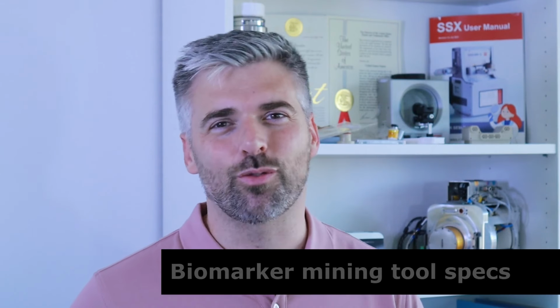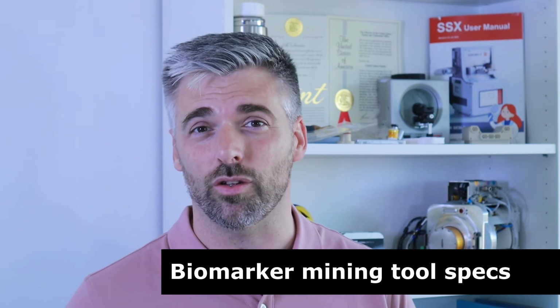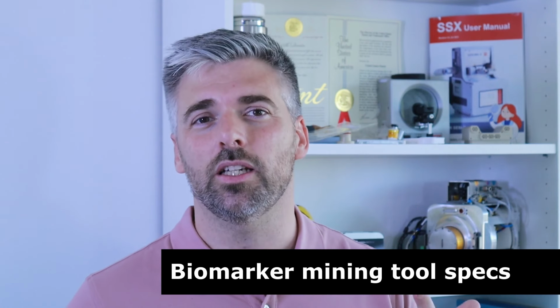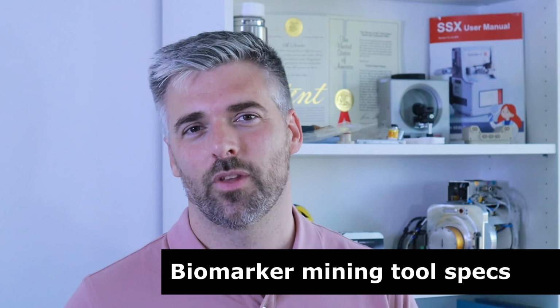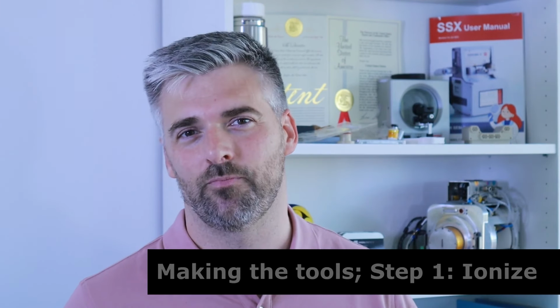To recap, the tools to enable breath biomarker mining must produce high-quality data for large molecules which are low volatility and low concentration. The breath analysis pipeline includes capturing molecules in breath, ionizing them, delivering them into the mass spectrometer, and analyzing the corresponding signals. And the quality of the data depends on the weakest link of all these steps.